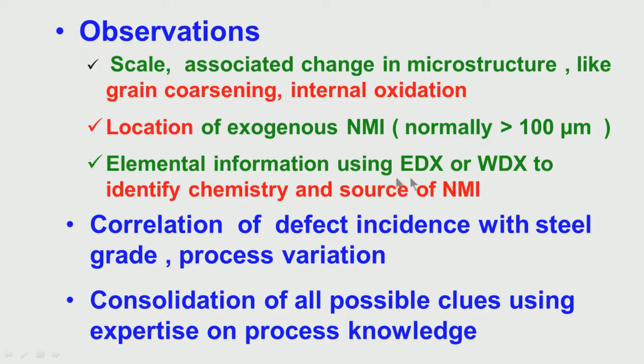Then I have mentioned we can do this under a scanning electron microscope if you have an attachment of EDX or WDX. EDX means energy dispersive analysis of X-rays, WDX means wavelength dispersive analysis of X-rays.